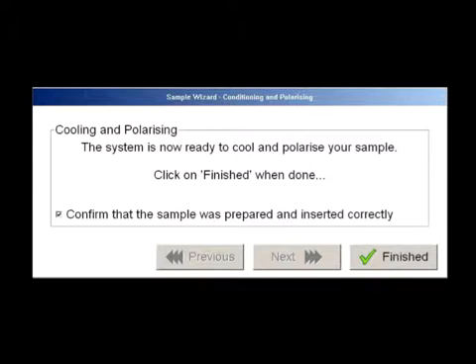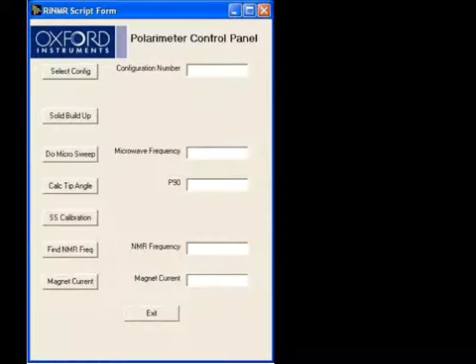So you really want to check to make sure that you've gotten the cup into the Hypersense, and only in that case would this box be checked, and that would be the typical case. But you just always want to check that. And when you click Finish now, the interface will say that you have a sample loaded, and you can go ahead and start doing your polarization.